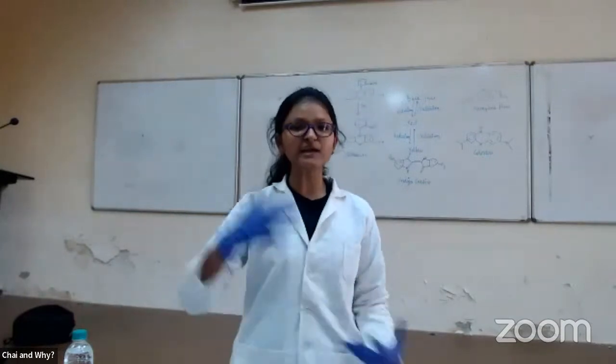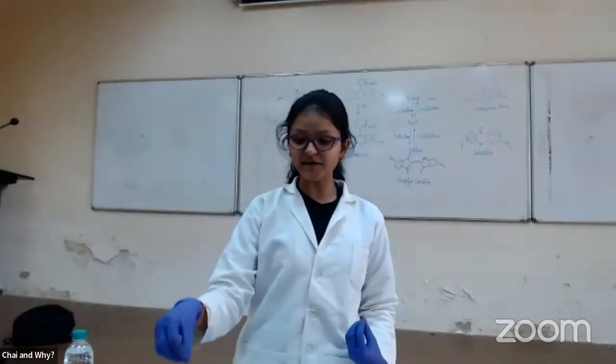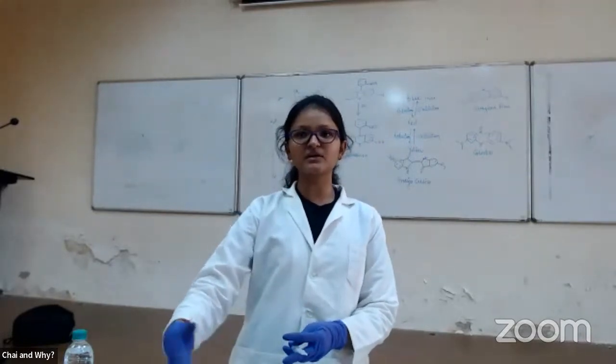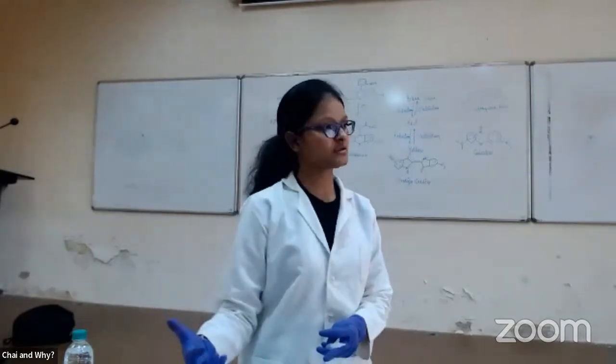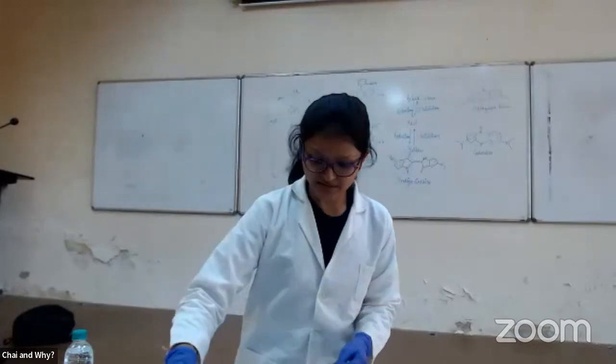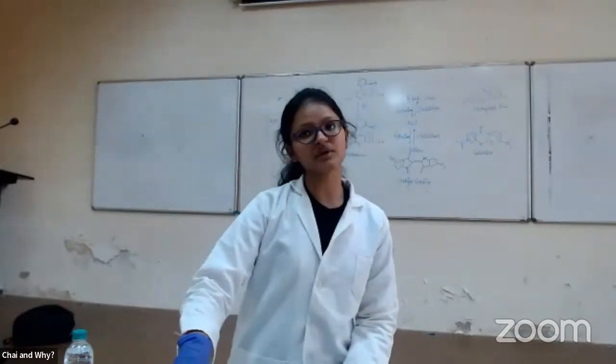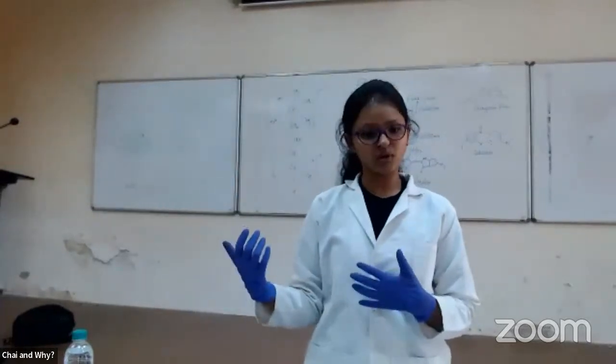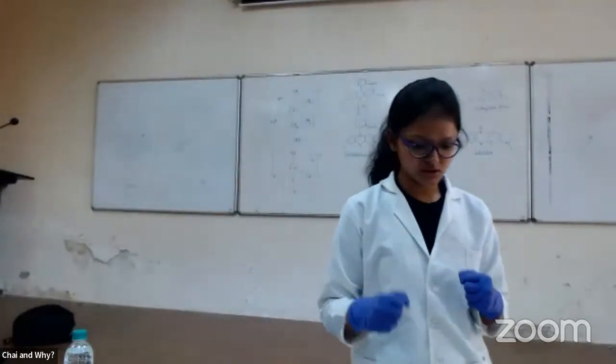Yes, but you have to dilute it much more because I have added a concentrated acid into it. And if you saw, when I initially opened this bottle, there were a lot of fumes. So it's highly concentrated. As I told you, this reaction is exothermic in nature, so if I put it in ice, it should go back. I'll do that experiment and show you guys.